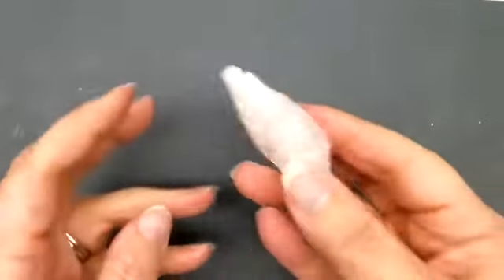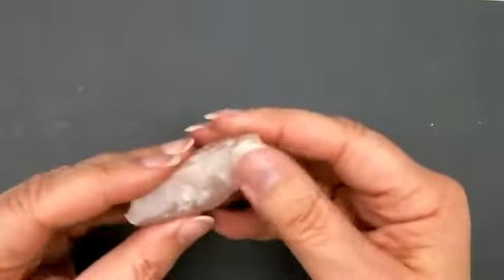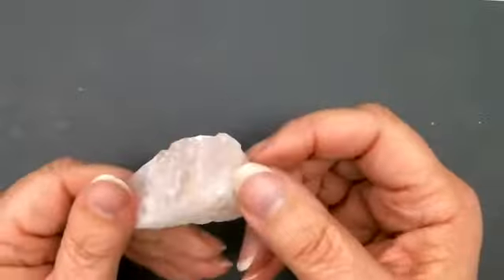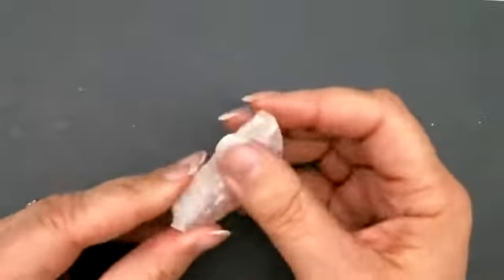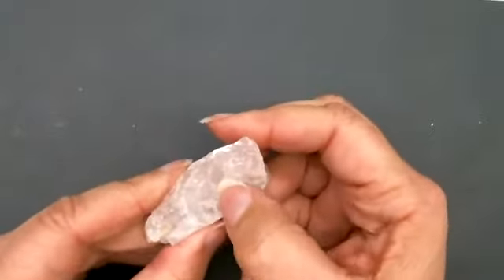All right, mineral number 19. This is the first one in the last set. Mineral number 19 is shiny. It looks like a glass. So that makes it non-metallic, non-metallic and glassy. All right, so let's go ahead and test the hardness.